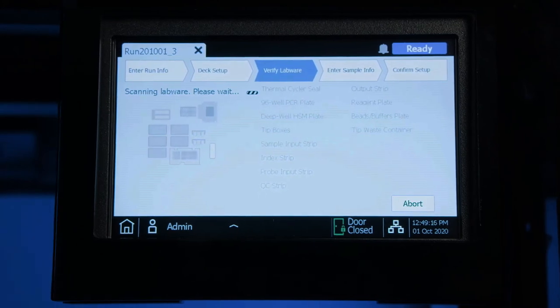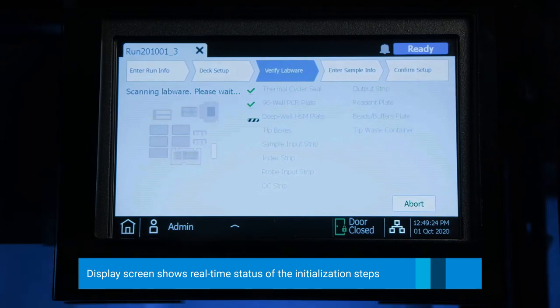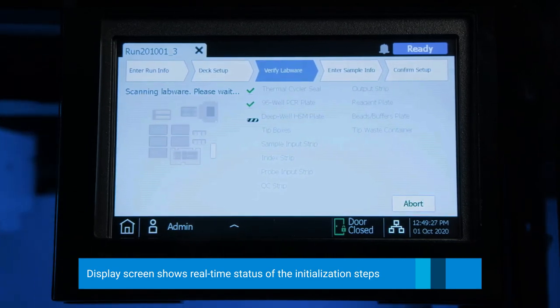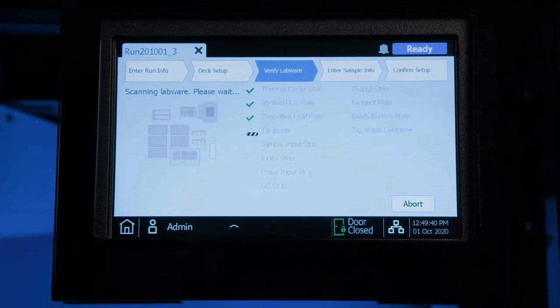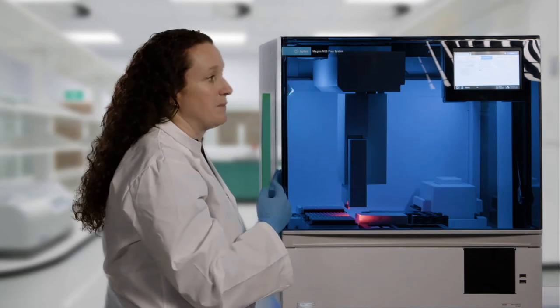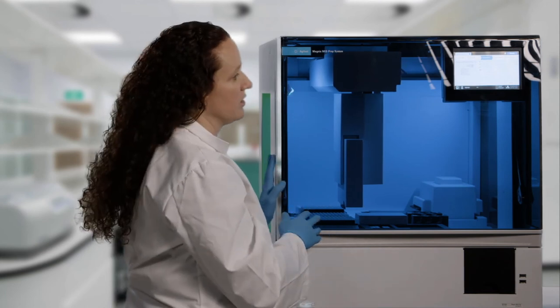Now it's going through and verifying all the labware. There is a list on the touch screen that it's going through — checking the thermal cycler seal, then the PCR plate, the deep well plate for the heater shaker magnet, and the tip boxes. What's interesting about the tip boxes is that it's actually scanning for the absence of the barcode. On the deck for the Magnus, the barcodes are listed, and it's scanning to make sure it's not picking up those barcodes — whereas everything else is actually scanning a barcode.